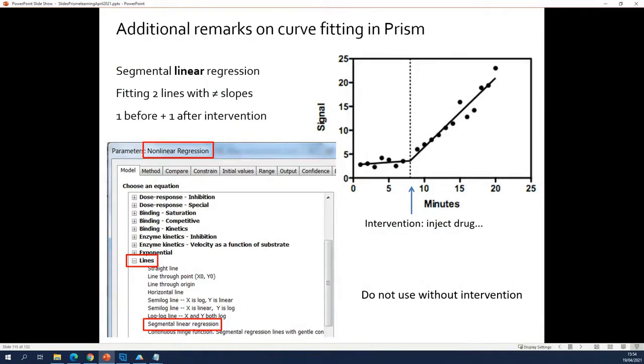This is something that I get asked relatively often. People who are doing an intervention will get a linear thing, but it consists of two lines. Before the intervention and after the intervention, you see a much more pronounced effect.